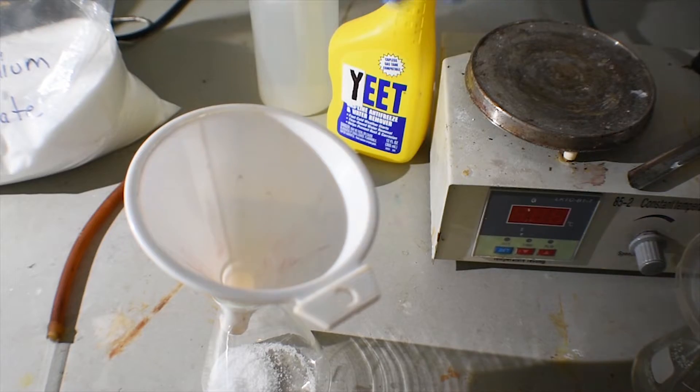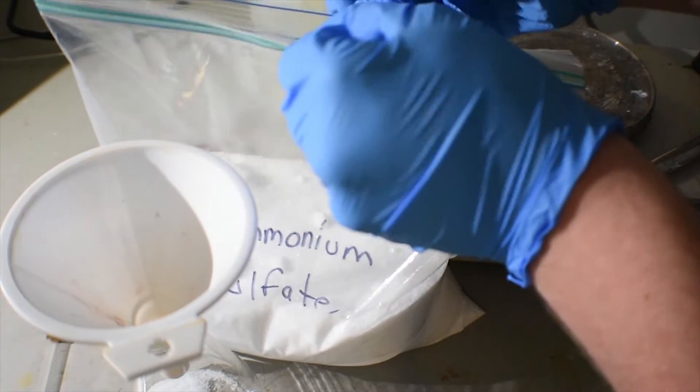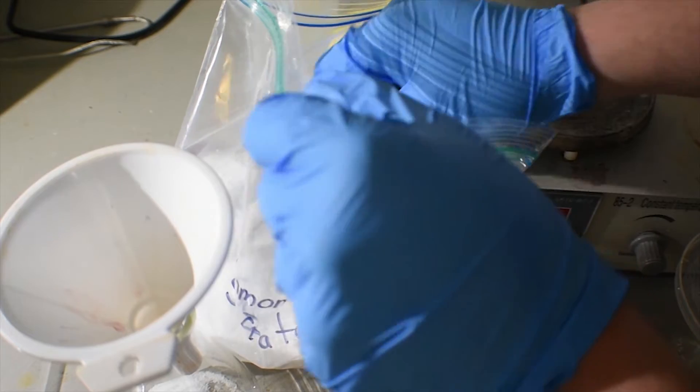I'm not going for exact amounts because the trimethylborate is really the limiting reagent, and we're not going to have it all reacted, so it's not a big deal.